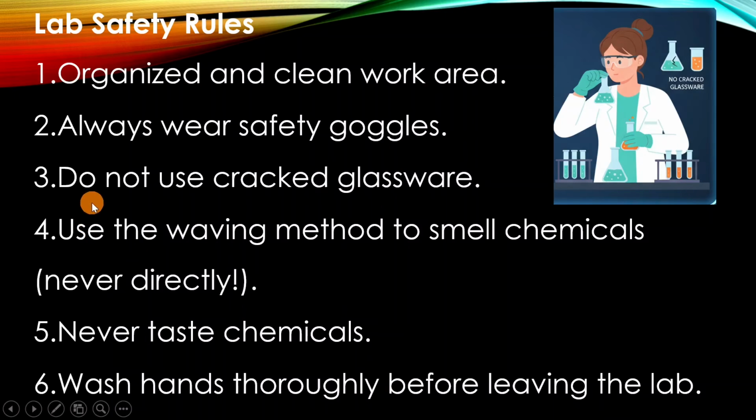Then do not use cracked glassware. You are not supposed to use cracked glassware like beakers, test tubes, and so forth. Those are not supposed to be used. Then use the waving method to smell chemicals. When you are in the laboratory, never directly smell chemicals.